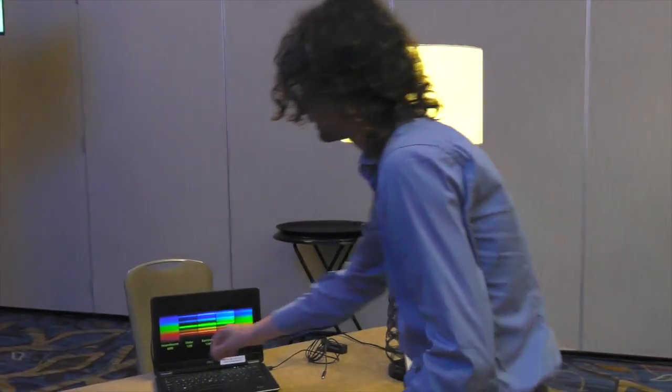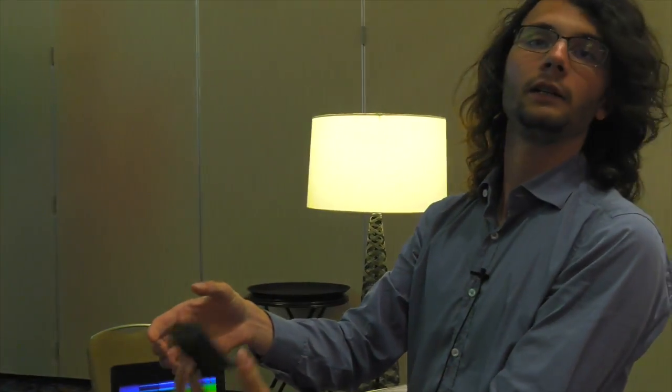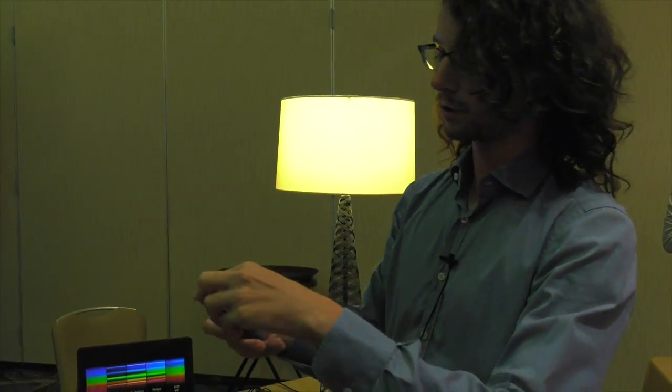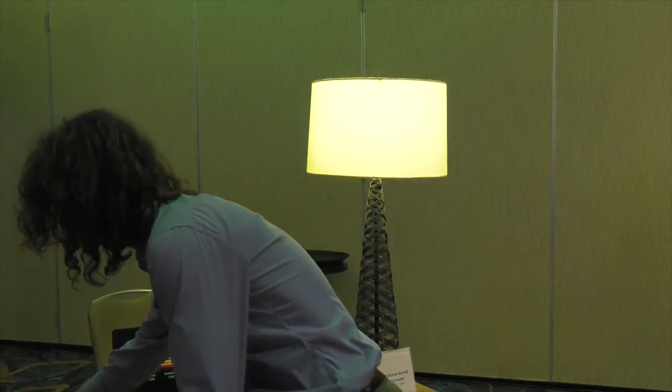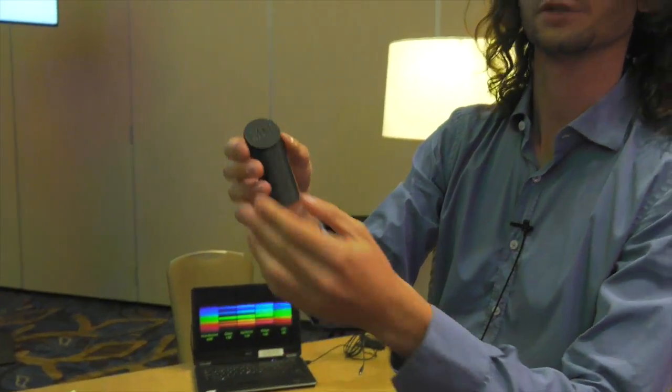But we went a step further and we used the 3D printer at the department to 3D print a portable model. This is actually one you can fit in your pocket, as you can see. This is the closed version.